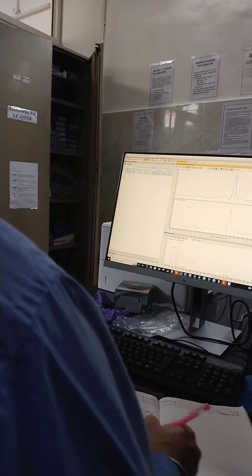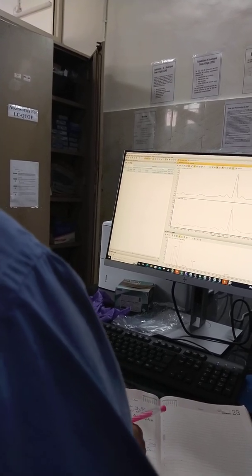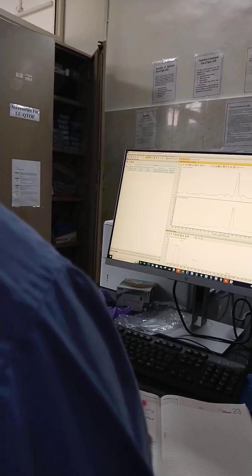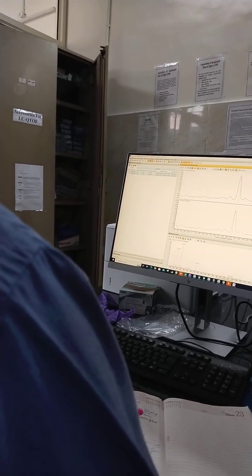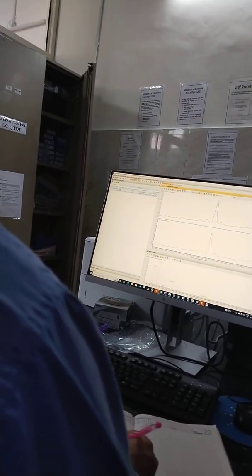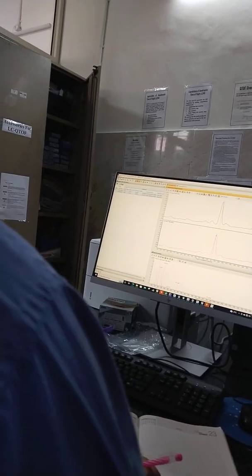Based on the inputs, it gives priority that this should be done first, this second. When we are doing an inclusion list, that priority is nullified by the list of masses we provide, so it is not feeding the quadrupole the same information. It is just making a priority that when I make a list for MSMS, I should definitely include these masses.